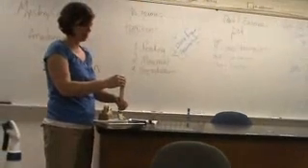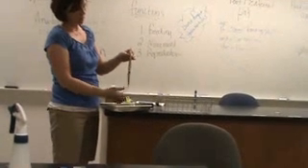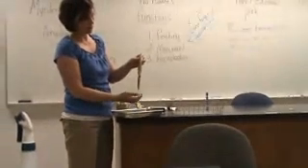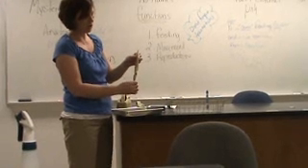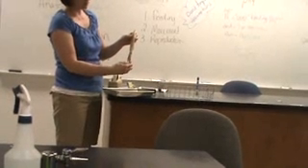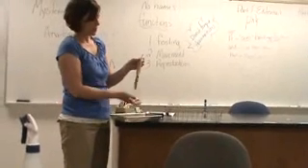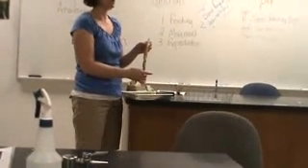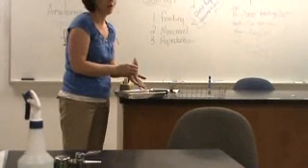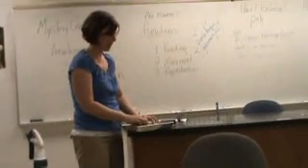Sometimes these get ripped apart when they're separated. I try to keep them together, but you might point out, if nobody's pointed it out, well, wow, look at these, whatever arms they are here, but look at these two here are much longer than the other ones, okay? And look at these two right here. They're not all the same, are they? Those two are a lot longer. What do you think could be the function of those as opposed to the other ones that are shorter? So just some things to point out if they're sticking to the obvious. Okay, so that's for the external.